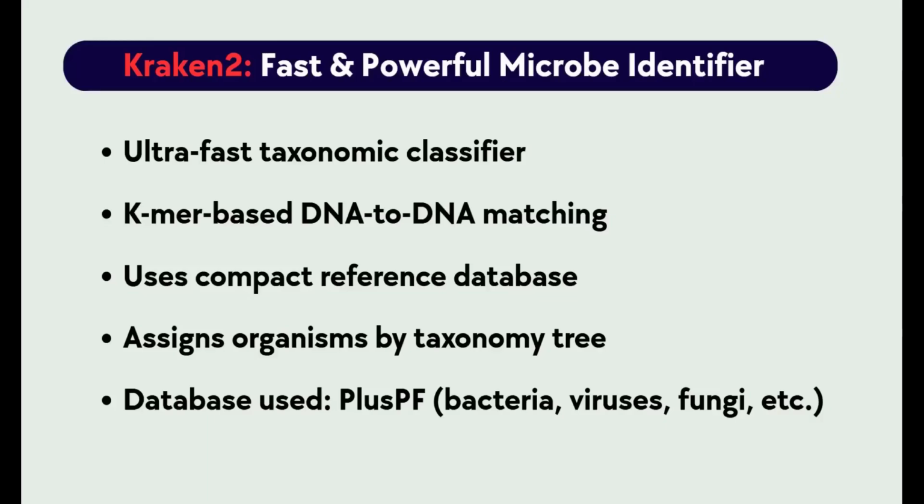Now, after getting our input reads ready, we have to run the Kraken2 tool on Galaxy just to know which microbes are present in our sample or in our data. I just want you to remember what we have mentioned about Kraken2. It was our expedition's rapid scanner. It was scanning the forest for signs of life.